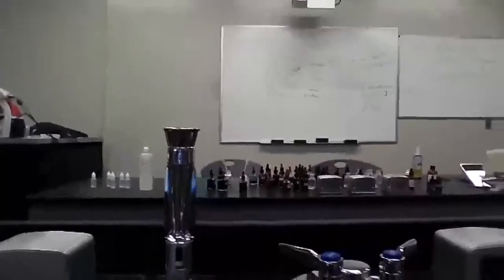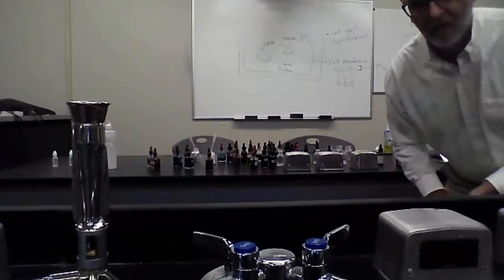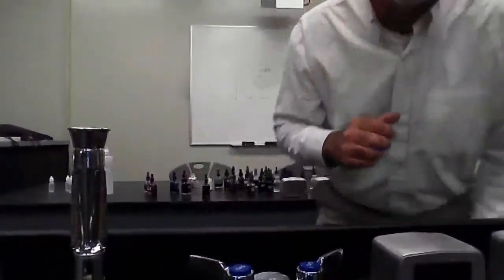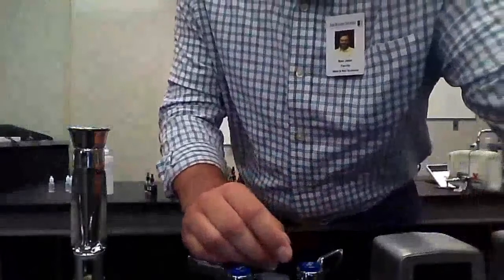Let's see if, when we turn this around, the board is in the correct configuration, because when I tried the other camera it was backward. Or is it? Well, it's pretty small. Oh yeah, there's no way you can see that. I can't really see it. I have to try to move the... Let me unplug. Did you stop the recording? No, it's still going. I was just going to pull this over.